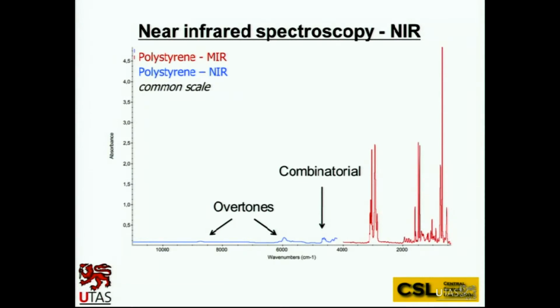So why is near-infrared so useful? Well, if you remember what I said about 5 minutes ago, we actually do struggle with normal mid-infrared with sensitivity. You don't need much material to get complete absorption of infrared light. So near-infrared being not as sensitive is actually a really good thing, because it means we don't have to worry much about sample preparation.